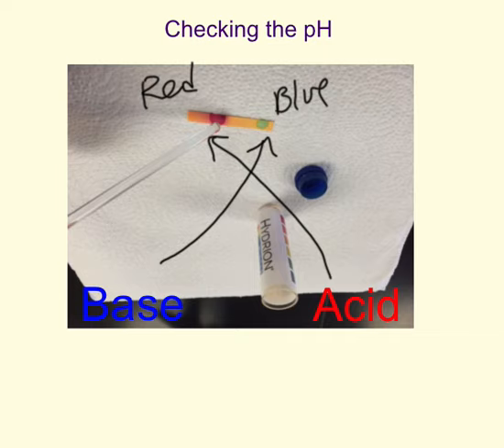What you're going to be doing here, at times you'll be asked to double check the pH, and we have to be really careful about conserving the pH paper because we can go through it pretty quickly. Chances are it'll be somewhere near your teacher's desk, because otherwise if we keep it out in the lab it gets really gross and can't be used again, with grubby fingers grabbing at it or a solution spilling on it.